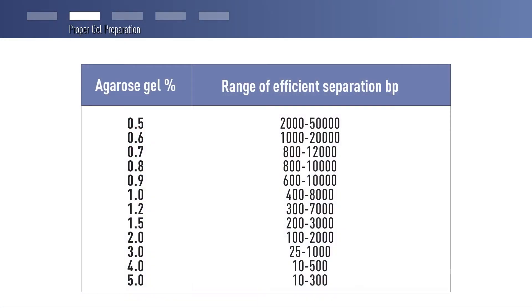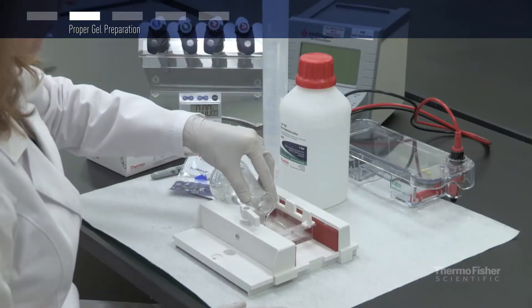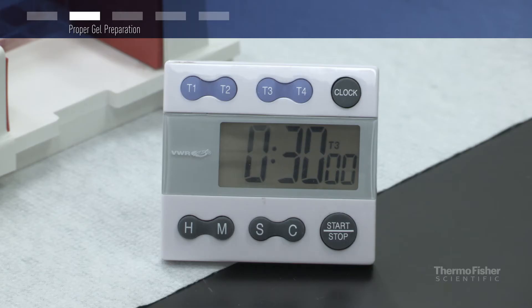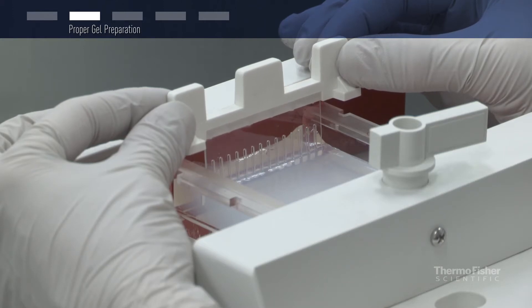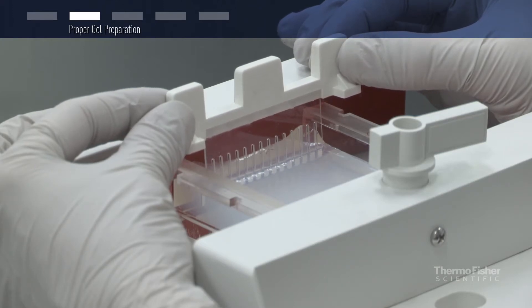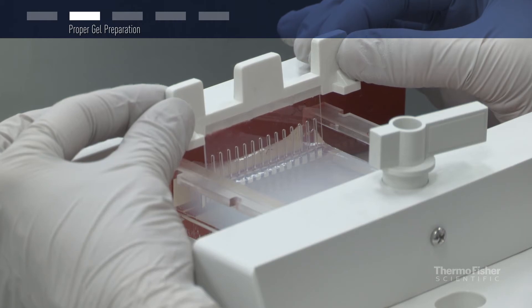Always prepare the appropriate gel concentration according to the sizes of the DNA fragments you want to analyze. After pouring your gel, be patient and wait until it is fully solidified. When pulling out the comb, be gentle and slow. Pull the comb straight out of the gel with constant and even force.